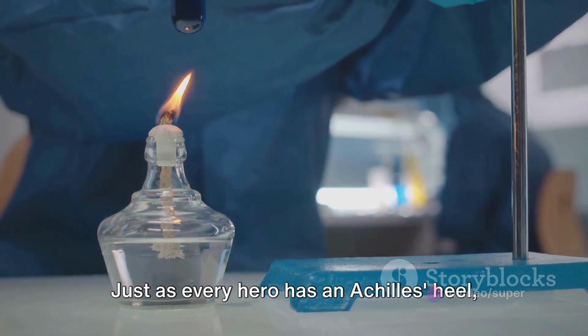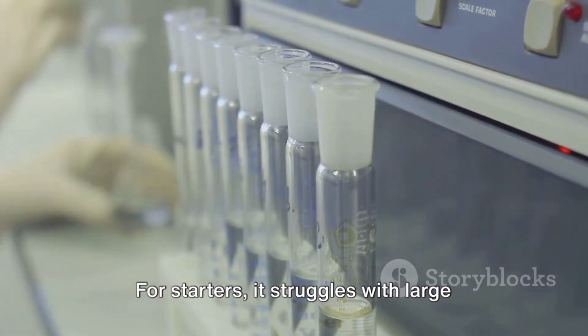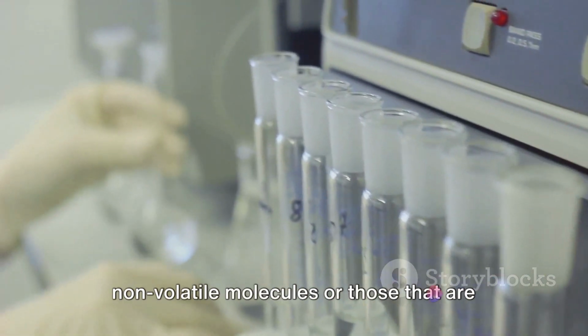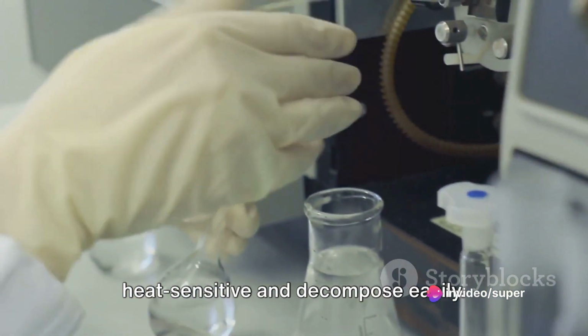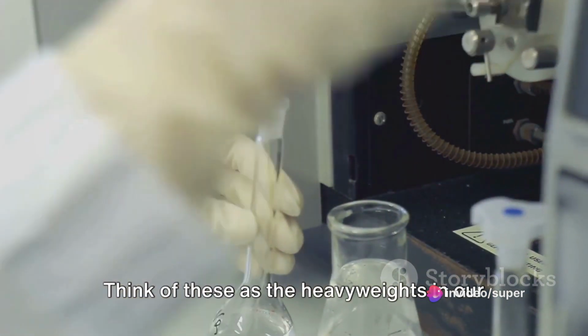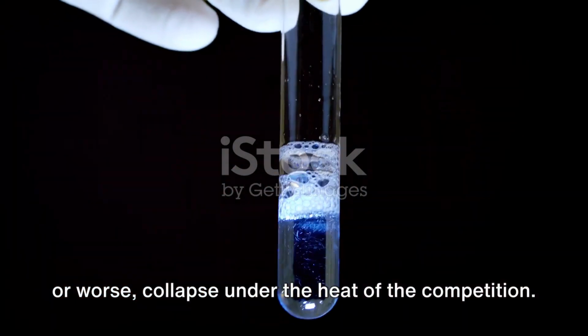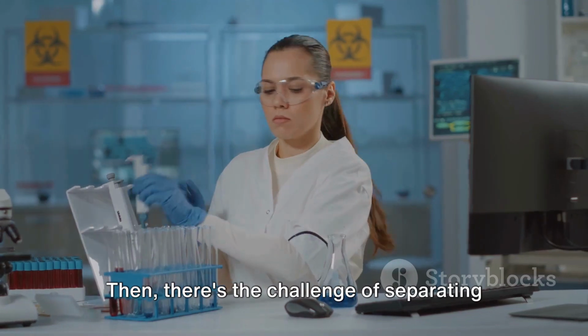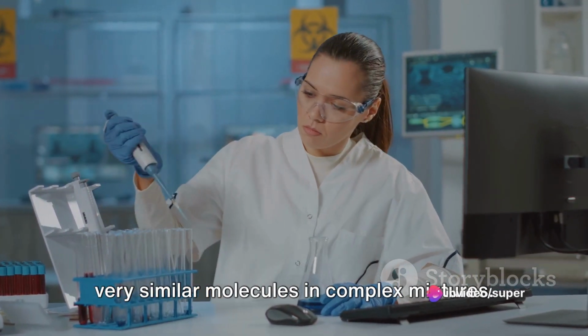While powerful, gas chromatography has its limitations. Just as every hero has an Achilles heel, so does our trusty technique of gas chromatography. For starters, it struggles with large non-volatile molecules or those that are heat-sensitive and decompose easily. Think of these as the heavyweights in our molecular race who either refuse to run or worse, collapse under the heat of the competition. Then there's the challenge of separating very similar molecules in complex mixtures.